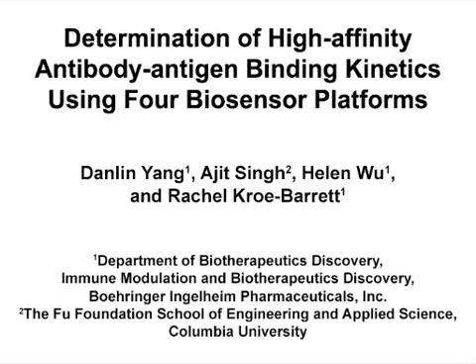The goal of this biosensor study is to compare the ability of the 4 routinely used biosensor platforms to provide quality kinetic data and to provide insights regarding technical challenges and considerations in experimental designs for evaluating high-affinity antibody-antigen interactions.